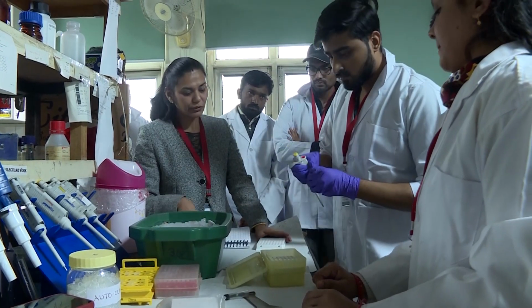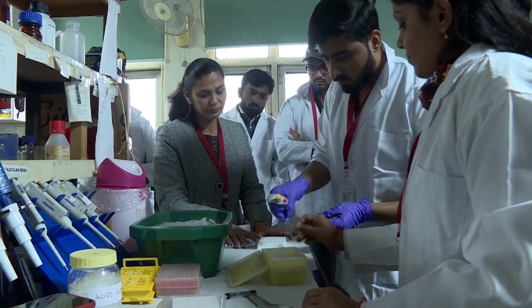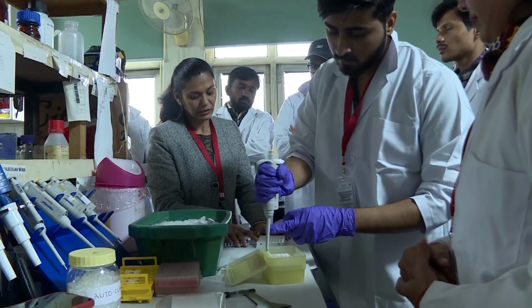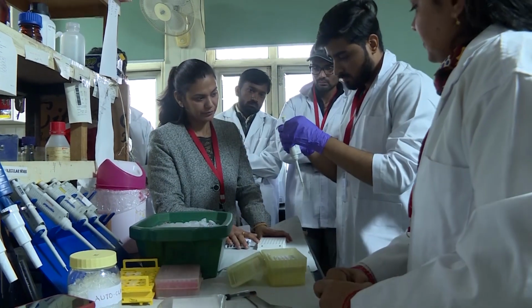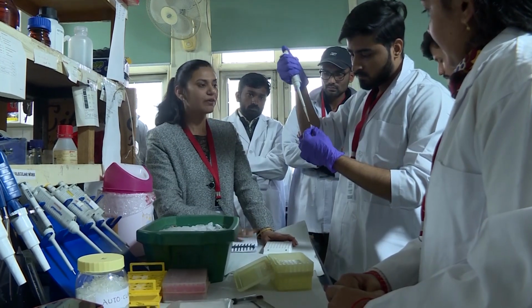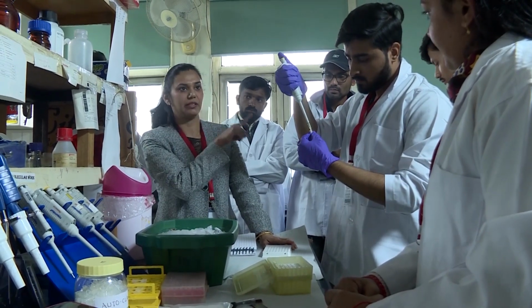Now actin control. A3, B3. And the same information we have to feed in the machine also.